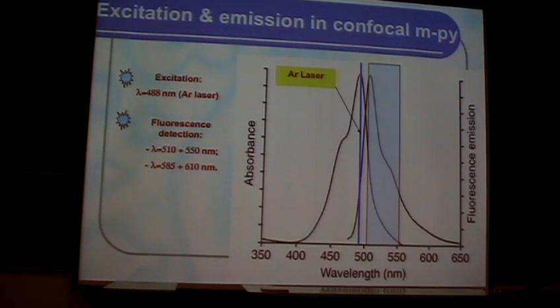And so in here, we illustrate the spectral range of detection of the fluorescent light in the case of this particular fluorescent dye.